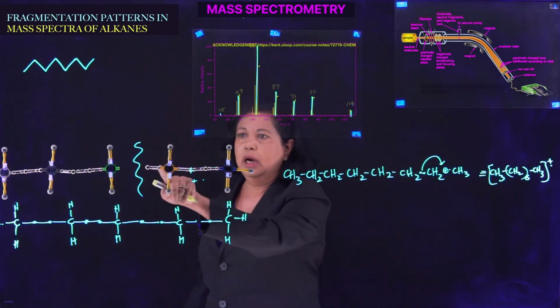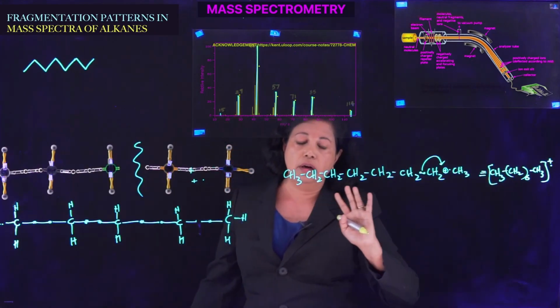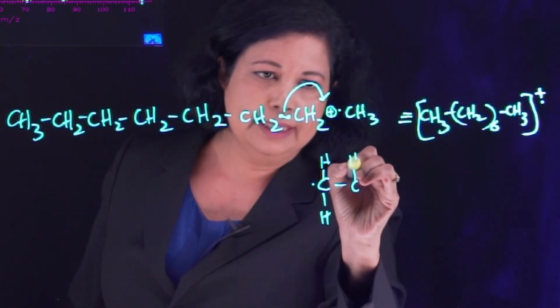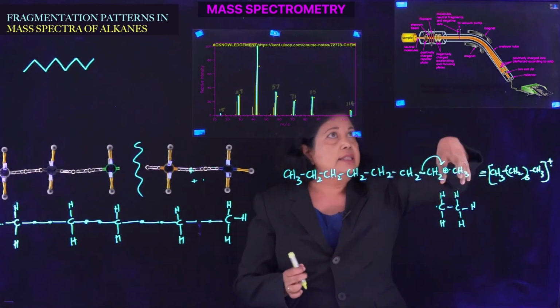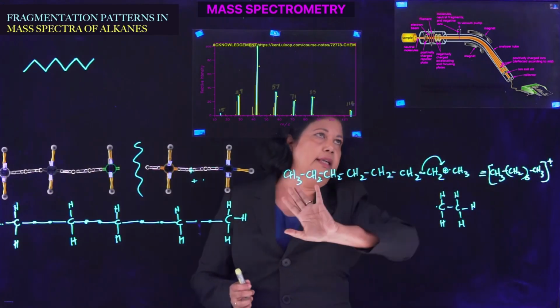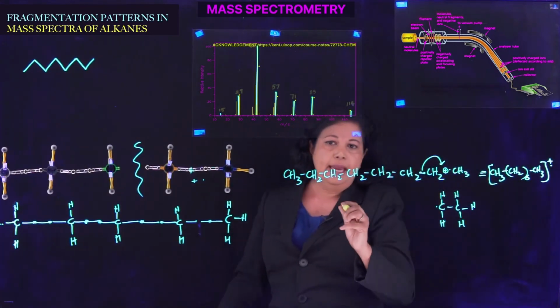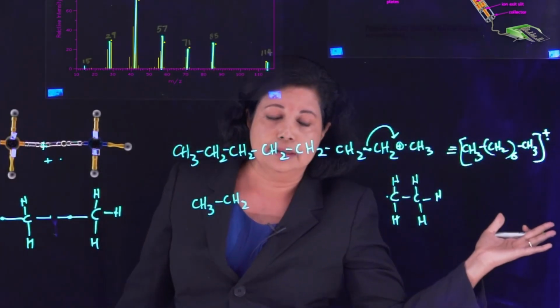If you look at this, 1, 2, 3, 4, 1, 2, 3, 4, they're all neutral, and since you have an unpaired electron there, that part is going to be the radical neutral part. The radical neutral part gets sucked up after it gets hit by the lightning. There's a tornado that just takes out your radicals, and your cations keep going. There's a negatively charged plate that's going to accelerate it, goes through this arc between a north and south magnet, and it's going to hit the detector.